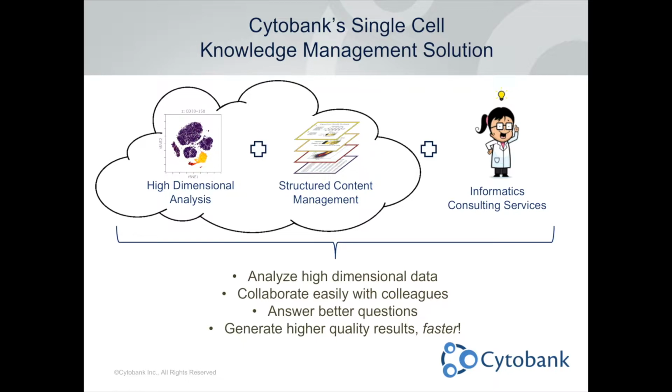I won't be talking about those today, but you can access videos on those on our YouTube channel, and we have webinars regularly that highlight aspects of these features. And we also have structured content management tools, and we'll be talking a little bit more about these today. These are things that help you organize, archive, and collaborate with your data.